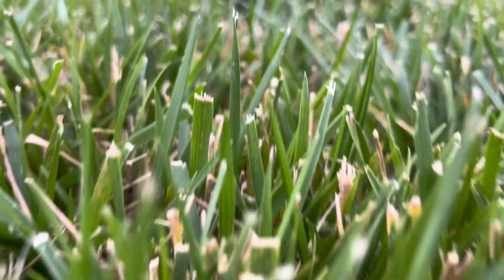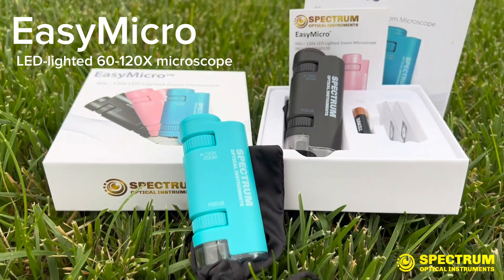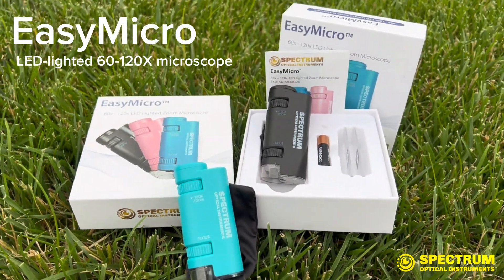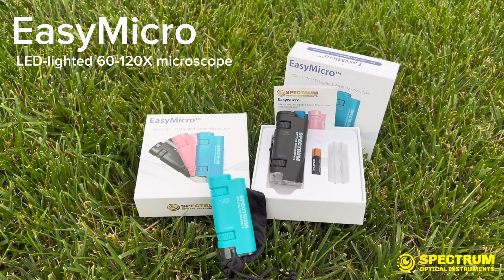Ever wonder what the world is like around you microscopically? Introducing the EZMicro, a compact LED-lighted handheld microscope kit designed to help you embark on a journey into the microscopic world.